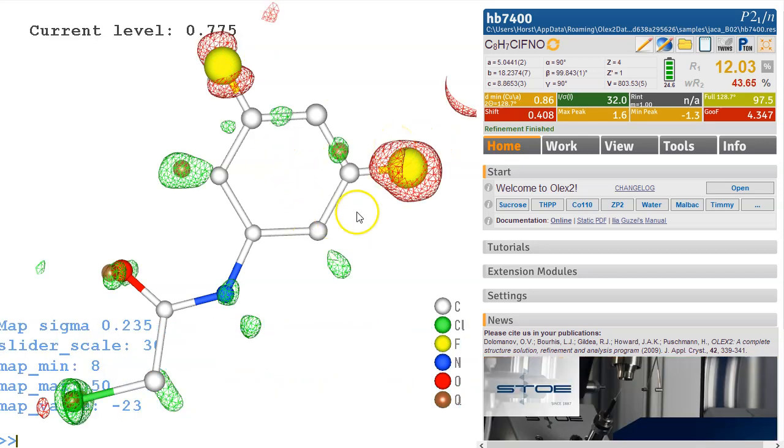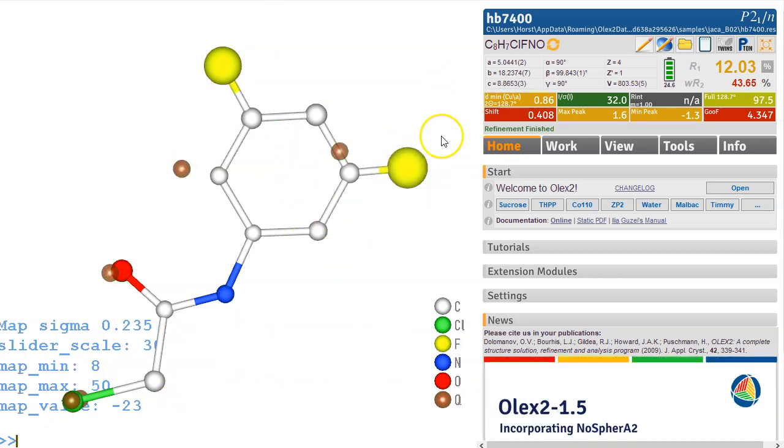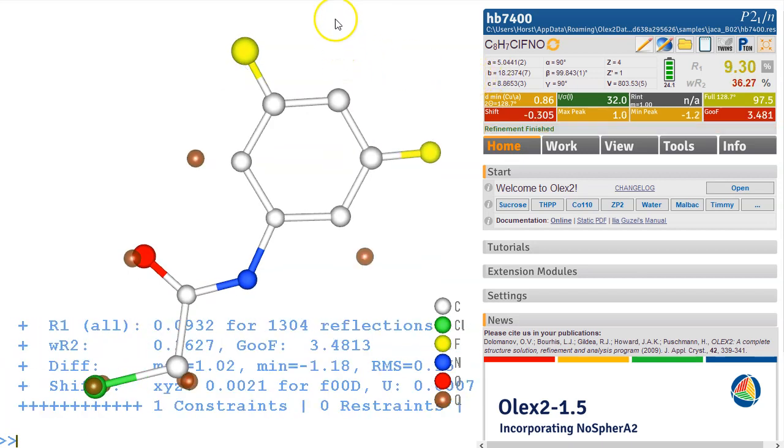So control M, this is the worst one so this will be part 2. So we're making this one here part 2 minus 21 and part 1 21. So they're linked together in the occupancy so they add up to one. One is in part 2 the other one's in part 1.